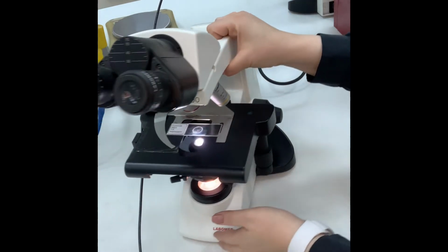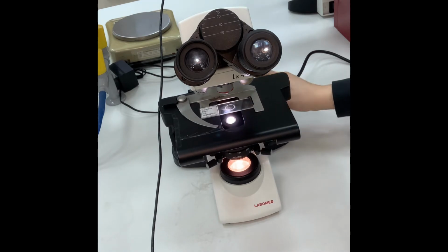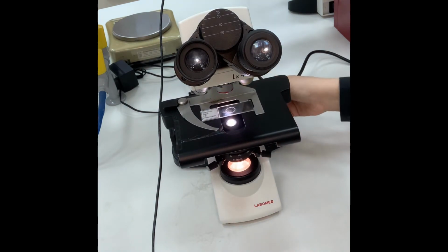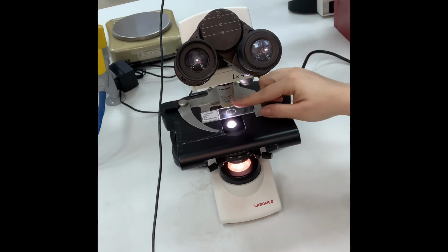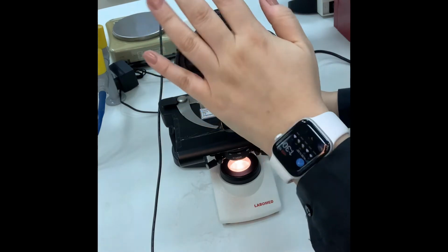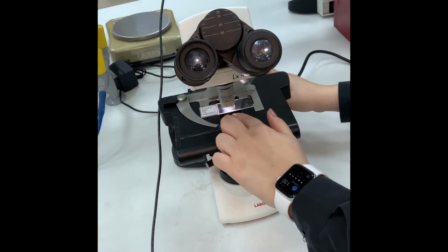Now, why do I choose the smallest objective over here? Because no matter how I keep pulling the coarse focusing stage, it won't touch the objective. I always start with a lower magnification, 4x, because if I use 10x while I'm pulling the stage with the coarse focusing knob, and I have to keep my eyes through the oculars to see the image, you need to be careful that you won't touch the slide and you won't break the slide.